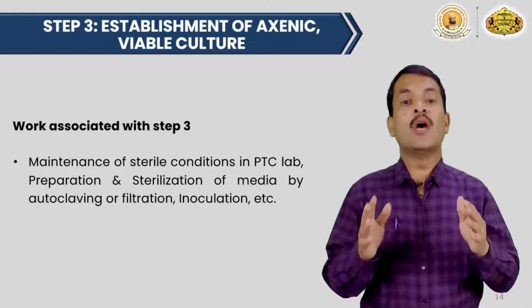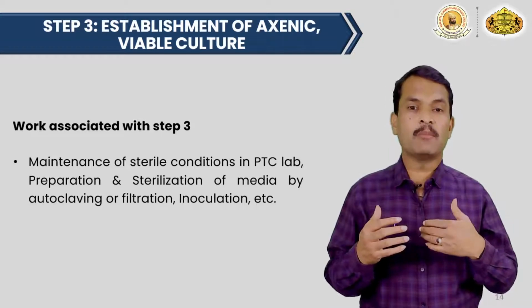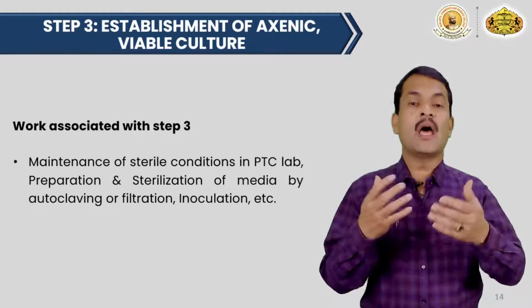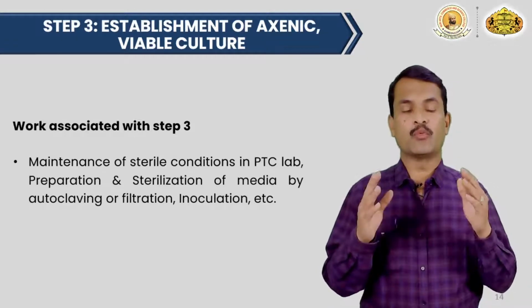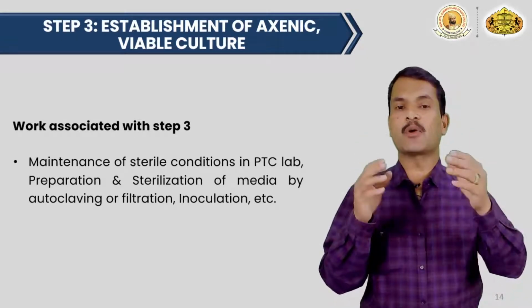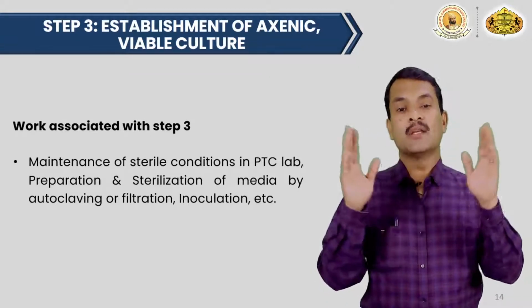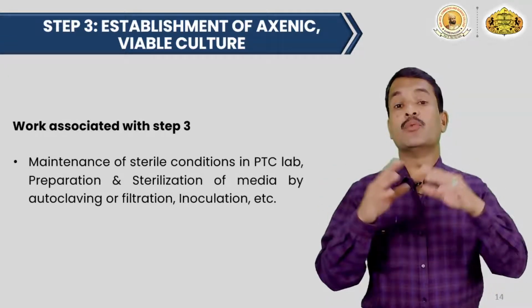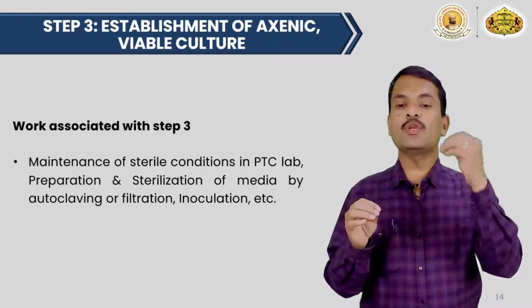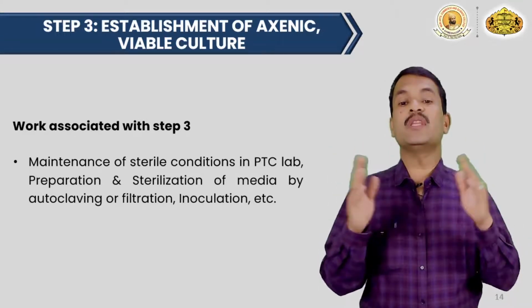How is it maintained? I have told you already about that in the last lecture. By means of suction, air is drawn in and passed through HEPA filters, which have a very small pore size. Because of that, filtered air is present in that cabinet, and there is no chance of contamination. Within that area we inoculate our explant onto the media. These precautions we need to take there.